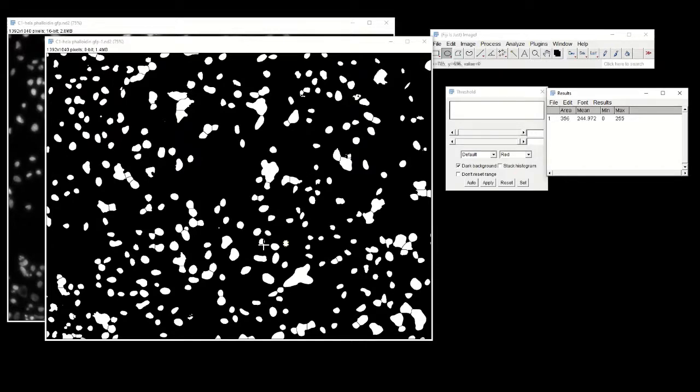And you repeat it with just a few more nuclei. And you don't have to be supremely accurate here. Okay, so you pick a few more, maybe this one as well. This looks like a nice little nucleus. We're going to pick this one, sorry, right here, Control M. And maybe just a couple of smaller ones. Maybe this one right here looks like a nice and circular nucleus. Okay, so Control M. So you can see that the smaller ones have an area of close to 200, and on average many of them are in the 300s. And there's some much bigger ones like this one, for example, which may or may not be more than a single nucleus. Okay, but we do know for a fact that these big blobs are more than one nucleus.